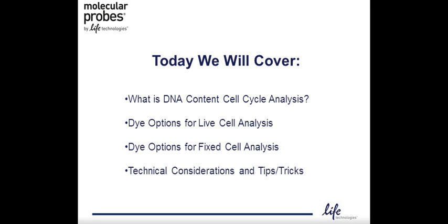So now let's begin. Today, we will define DNA content cell cycle, look at reagent options available for cell cycle analysis in living cells, and additional options available for fixed cells. I'll spend the majority of time reviewing technical considerations for successful testing and offer numerous tips and tricks.